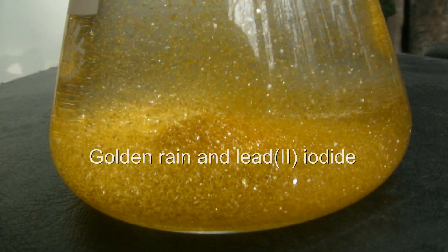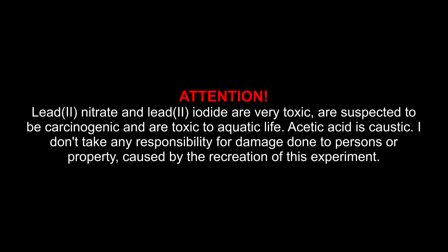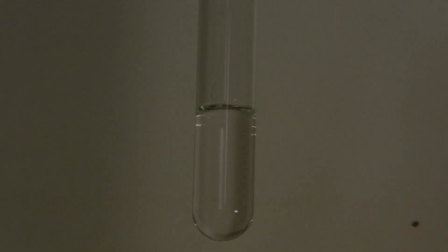Golden rain and lead(II) iodide. Attention: Lead(II) nitrate and lead(II) iodide are very toxic, are suspected to be carcinogenic, and are toxic to aquatic life. Acetic acid is caustic. I don't take any responsibility for damage done to persons or property caused by the recreation of this experiment.